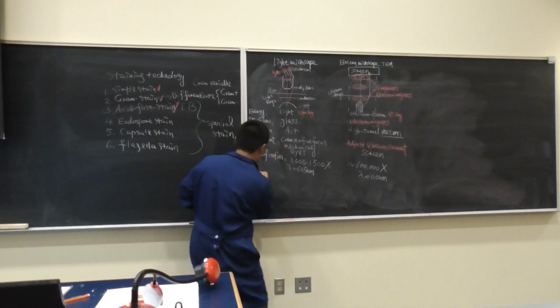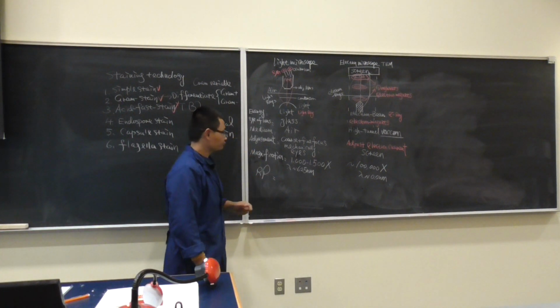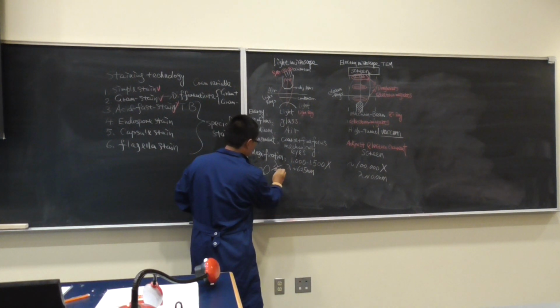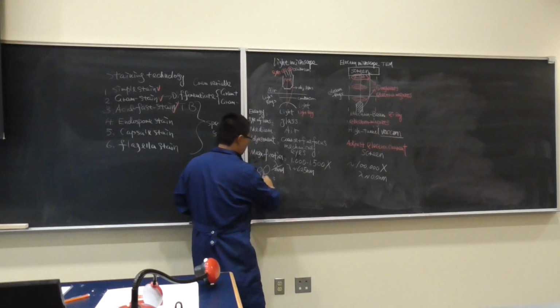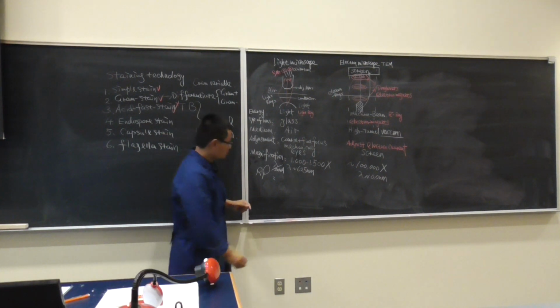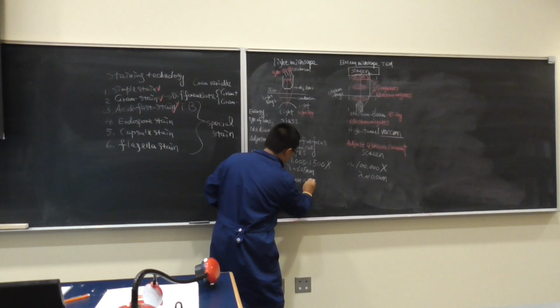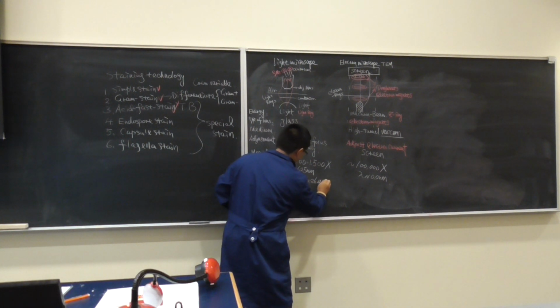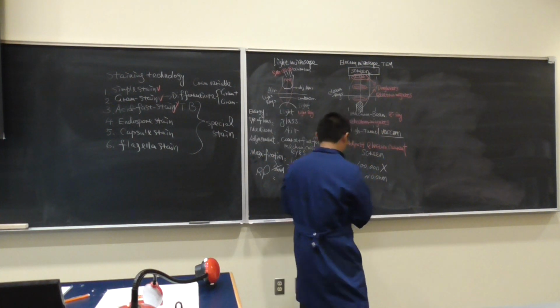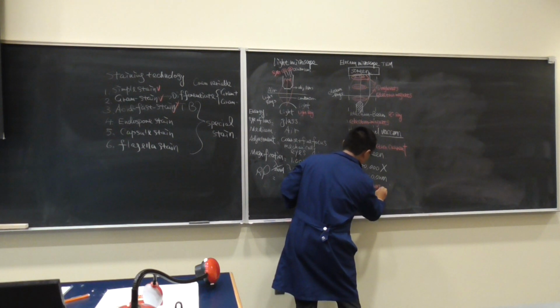Remember the resolution power? Now we're going to talk about the resolution power. Lambda divided by 2 multiplied by NA. The same thing. So what is the resolution power of a light microscope? Is that 260 nanometer, equals 0.26 micrometer? How about the electron microscope? Very small. 0.02 nanometer could be.